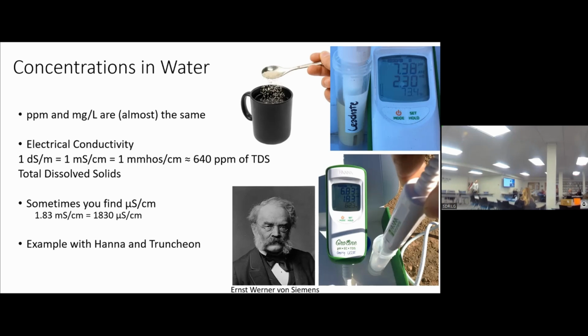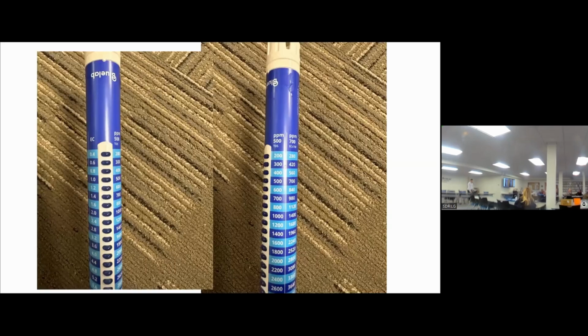It's a bit of a moving target then, really, isn't it? Depending on what the dissolved solid is. It's an estimate. Yeah, it's not exact. But it's a good trick, because these instruments are very cheap and very simple. You're in the ballpark, you kind of know where you're at.